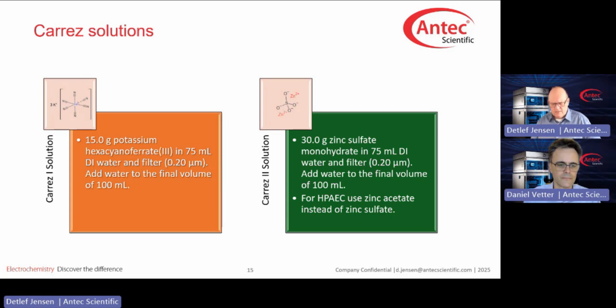So if you inject zinc sulfate, it could happen, depending on the analytical conditions, of course, that all of a sudden the retention times of the sample we are looking at are shorter than with the standard. Now, if that is the case, then the remedy might be to substitute zinc sulfate with zinc acetate.